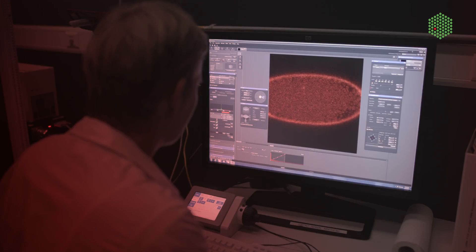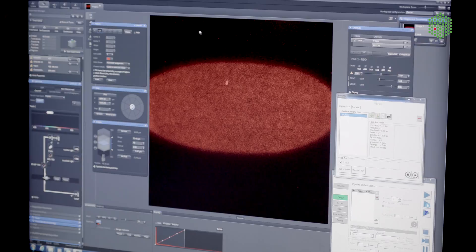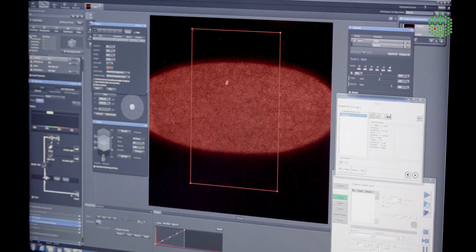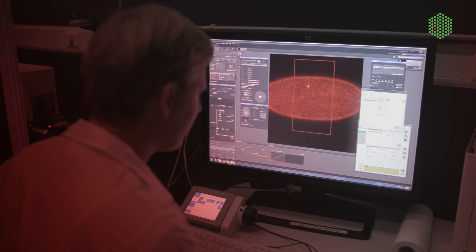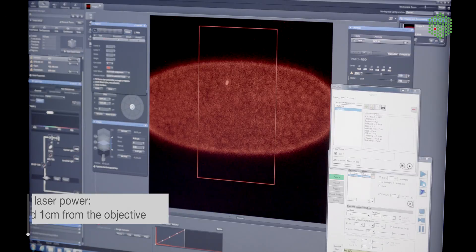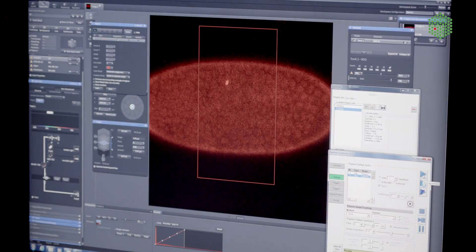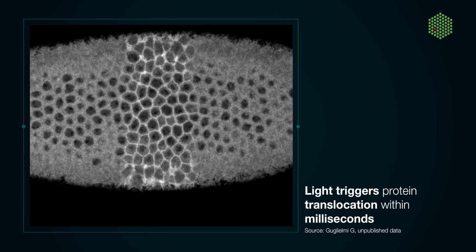If we now want to interfere with this morphogenetic event by manipulating the membrane composition through recruitment of OCL in a spatially restricted area of the embryo, we need to specify the region of activation and the size of the tissue that we want to activate. As we only want to interfere with the apical membrane, we set an activation stack of 5 micrometers. Since the extent of Cry2 activation depends on the laser power, we also specify the optimal laser power based on knowledge from previous experiments. We use a macro to alternately image the mCherry-tagged Cry2-OCL in the whole embryo using red light and to specifically activate the region of interest using the 950 nm multi-photon laser. The light-induced interaction of Cry2 and CIBN triggers protein translocation within milliseconds and is reversible with a half-life of about 8 minutes. Depending on your experimental scheme, you may need to maintain or repeat the light activation.